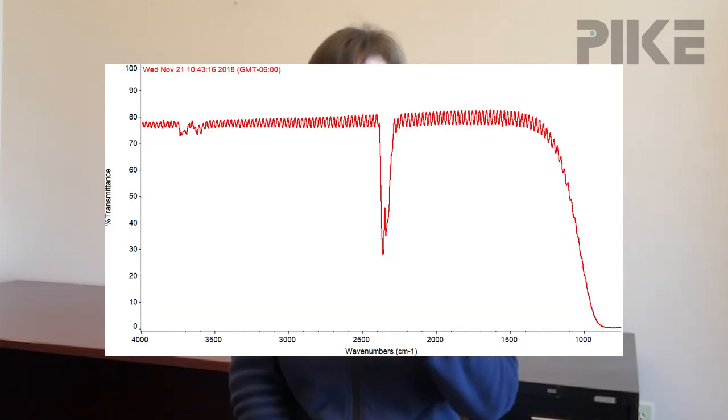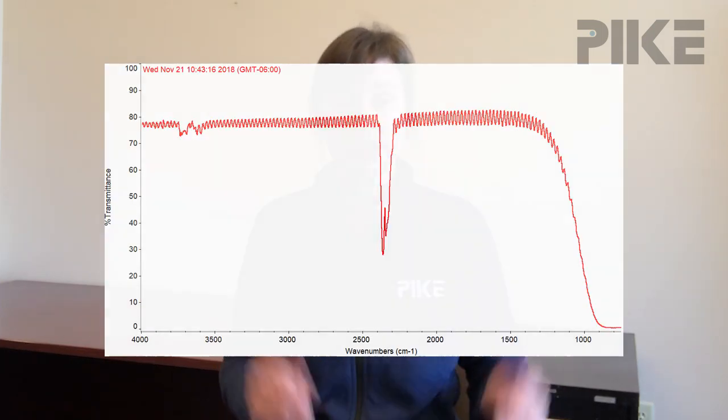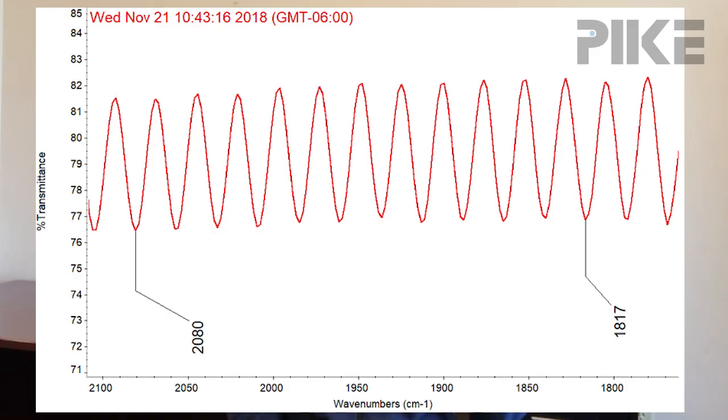You'll see a little fringing pattern throughout the spectrum, and from that fringe pattern we can go ahead and calculate the path length. So step two, you're going to zoom in on a section of that fringing pattern. We're going to take two points within that sinusoidal wave and count the number of fringes in between. In this case, my first point is 2080 wavenumber, and if I count the number of fringes all the way down to 1870 wavenumber, that's 11 fringes.